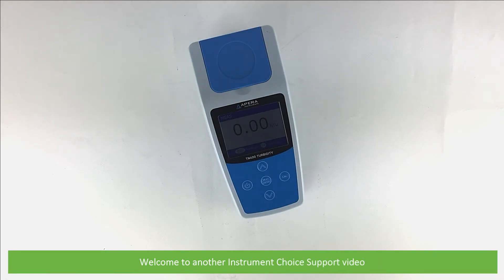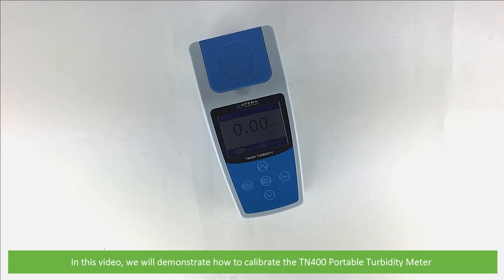Hi and welcome to another Instrument Choice support video. In this video we will demonstrate how to calibrate the TN400 Portable Turbidity Meter.